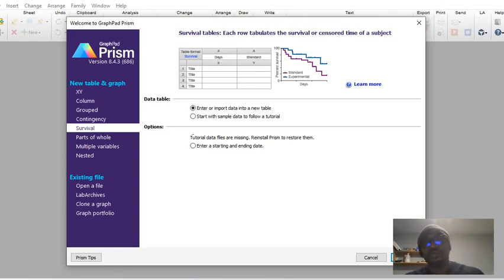I'm bringing forward to you a lecture on GraphPad Prism. I noticed that a lot of us cannot handle our own data, and we choose to give this analysis to people to do it for us. Most of the time, these same persons do not really know how to use this software, and so they do whatever they want to do and hand over this data to us, and we believe that they have done it so well. So I want to give you a short preview on the first things you need to do when you have the GraphPad Prism.